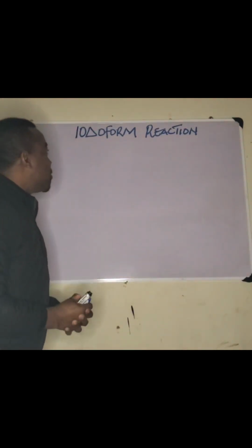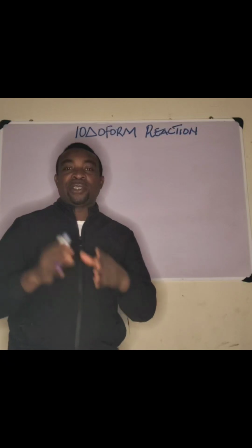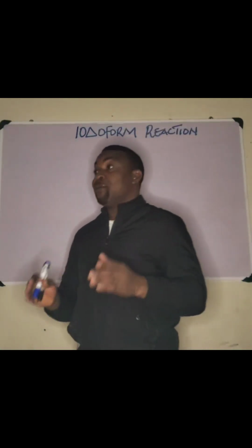Today we have the iodoform reaction. It will help us to distinguish or differentiate ethanols or alkanols from ethanoic acid or alkanoic acid. This iodoform reaction is very important.